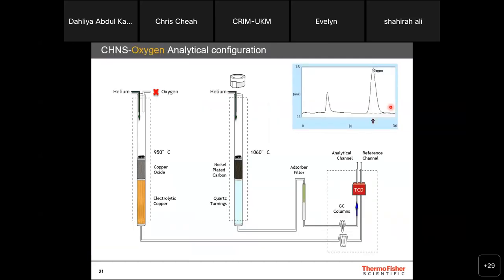Okay, one point to highlight further is this system is at atmospheric pressure. So in our laboratory environment, our air always contains nitrogen. So how do we make sure that the external environment will not affect our analytical result? It is by helium. So this is why helium will always purge. The term is actually called purge. It will purge through the entire autosampler to insulate the system from external influences, so the result that you're getting is truly from your sample.